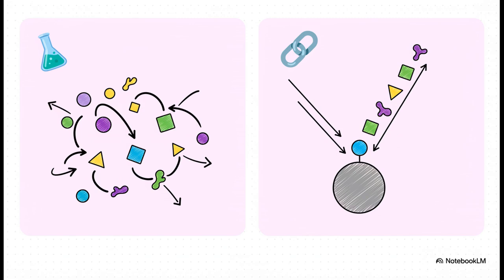The first big idea is something called solid phase synthesis. See, if you just tossed all your DNA building blocks into a beaker, you'd get chemical chaos. They'd react all over the place. But what if you anchor the very first molecule to a solid surface? Suddenly, you have control. You can add your next ingredient, let it react, wash it away, and then add the next one. It brings order to the entire process.